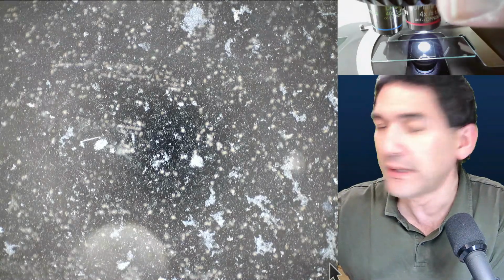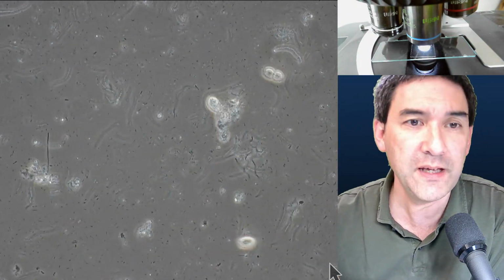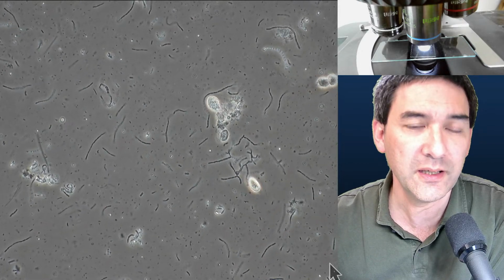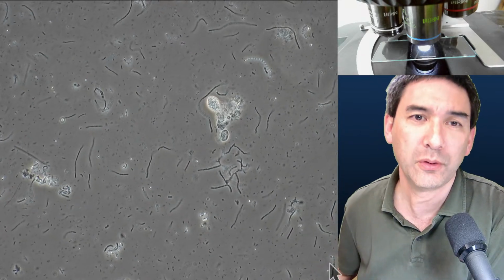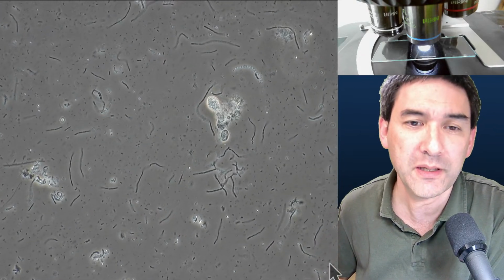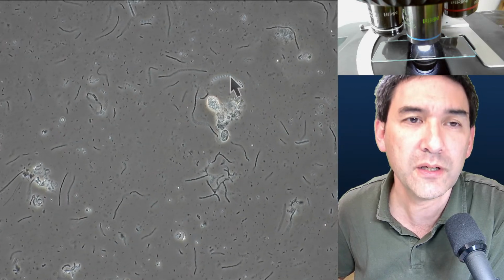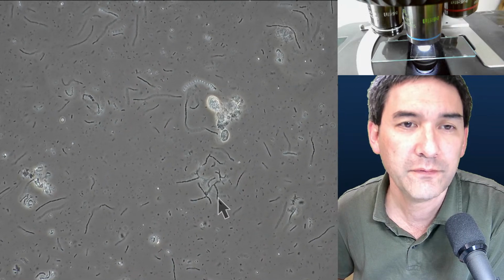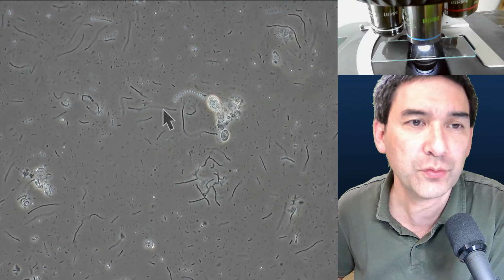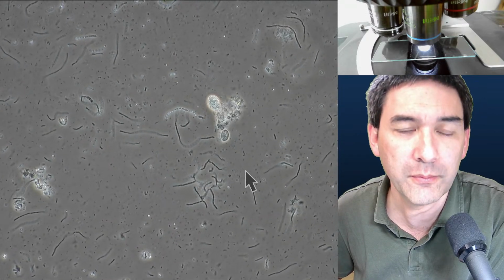Let's have a look now at phase contrast, just because some of you might be interested. And this is now phase contrast, and of course, a typical phase contrast application, because now the bacteria look very dark. Look at even some here in short chains. The phase contrast optics convert differences in refractive index into brightness differences. Some of them are even moving around.